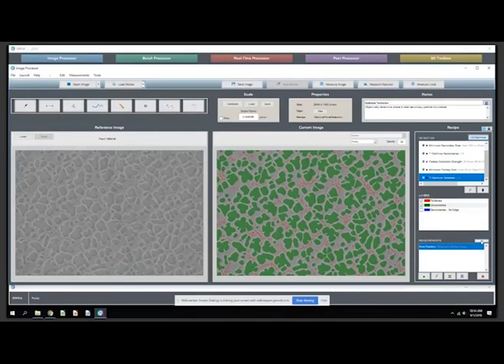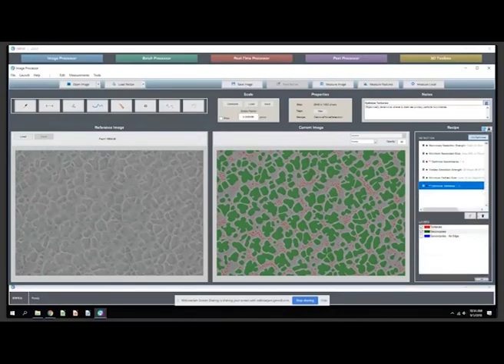However, in simple mode, which you see with this lock switch engaged, all you see are the few flagged settings that we have identified as the critical ones that you might need to adjust should you apply this to another problem. So you're still able to get under the hood completely by sliding this lock switch and customize the recipe infinitely. Our image analysis experts enjoy using this tool to build algorithms rapidly from the ground up.